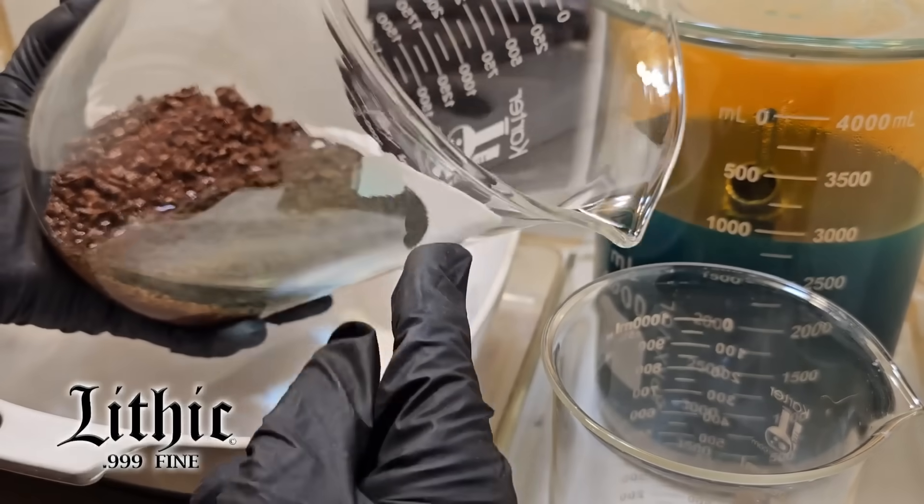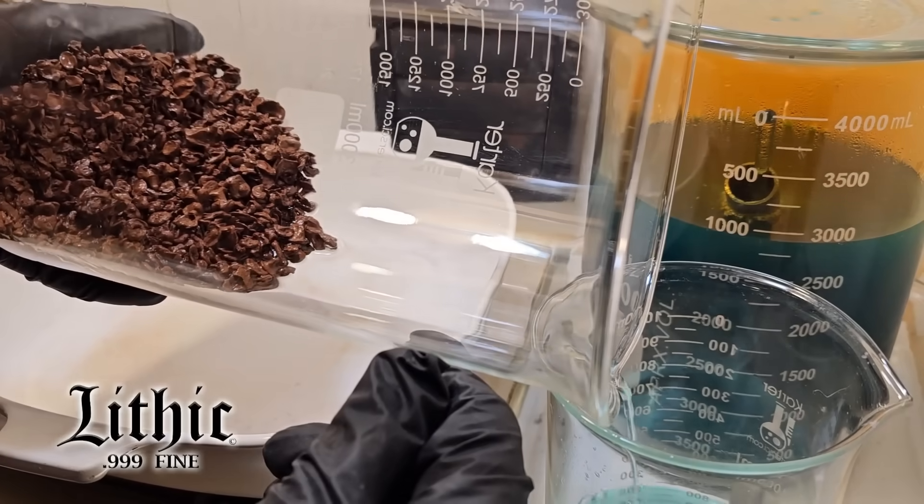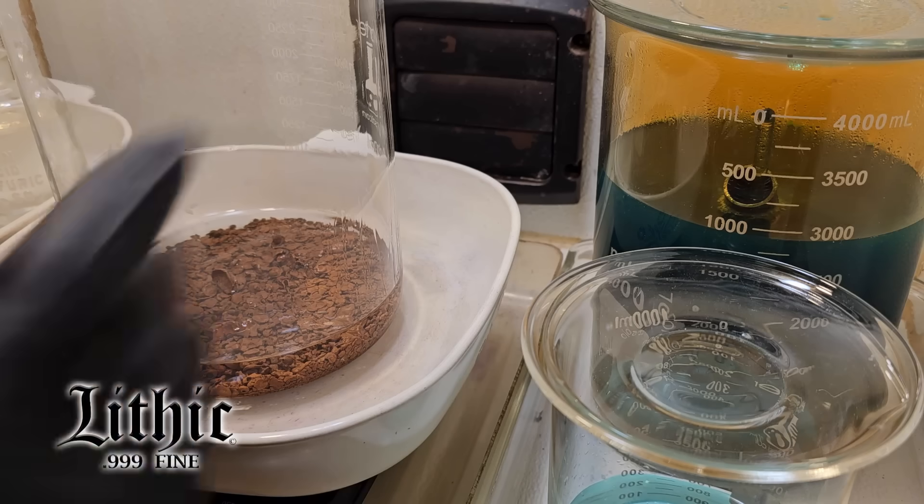As I go and pour this off, you'll see just a tinge of color yet. Some of that could have been dragged off from the solution before, but I think we're getting really close here.